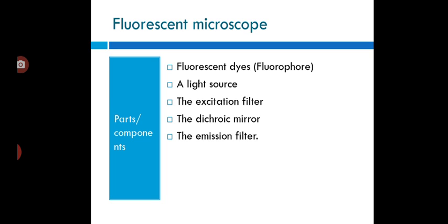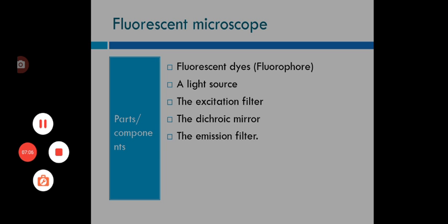There are two types, fluorochromy and immunofluorescence. Fluorochromy involves the non-specific staining of any bacterial cell with a fluorescent dye, while immunofluorescence uses antibodies labeled with fluorescent dye to specifically stain a particular bacterial species. Fluorescent microscopy has also been employed for detection of antigens and antibodies to identify structures in fixed and live biological samples. So this is about the fluorescent microscope.